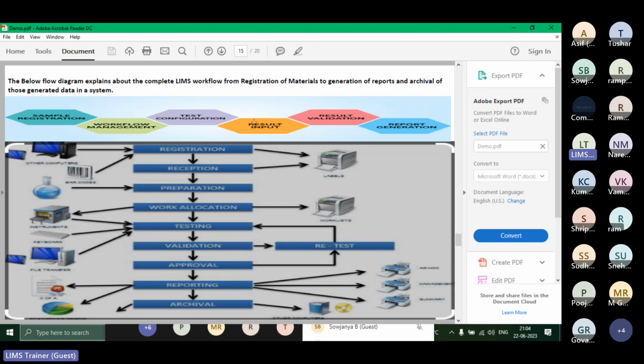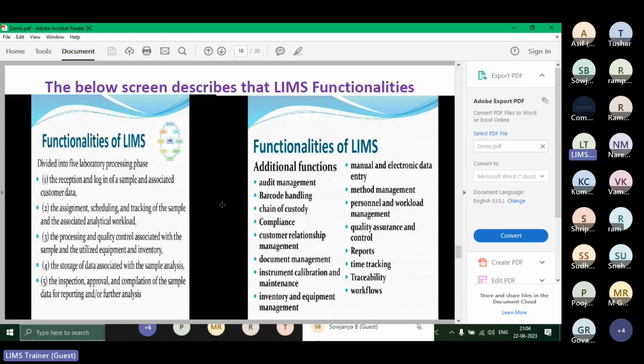After the reporting is done, after some weeks or years, as per their policy, they'll archive it. They don't delete it, they'll archive it. Store it somewhere, maybe remove it from the LIMS, but store it somewhere, as per the standard set by different pharma companies.